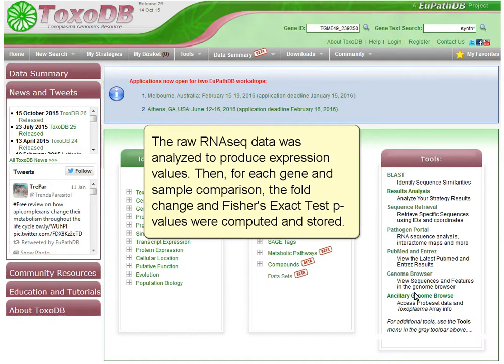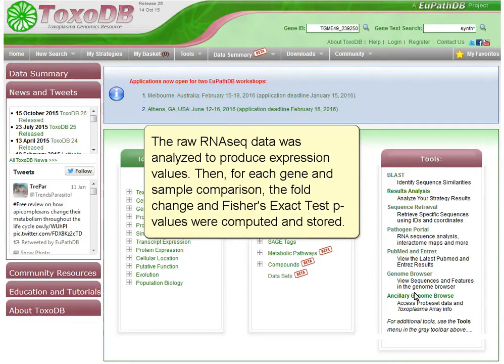The raw RNA-seq data was analyzed to produce expression values. Then, for each gene and sample comparison, the fold change and Fisher's exact test p-values were computed and stored.